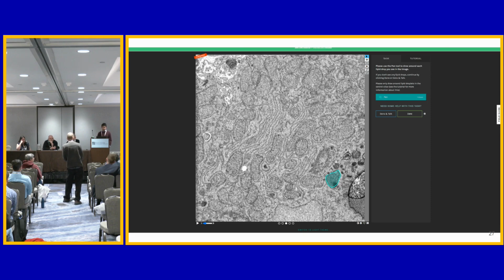First of all, I want to thank you all for this incredibly useful and informative session. So I'm a little bit afraid because I'm starting to get a trickle of users into my microscopy core who are starting to use some of these AI tools. And I think what I'm starting to see is that people are doing it because it's easy and it looks pretty in the end, but they don't necessarily know what they're doing. I don't know it well enough myself to teach them the critical thinking skills about what they're doing that I would do for image acquisition. So I'm curious to hear what your thoughts are on what they should be knowing about the tools that they're using before they start using them.